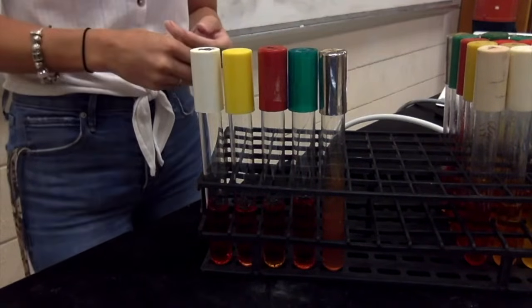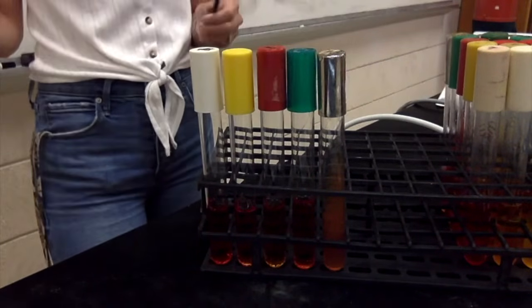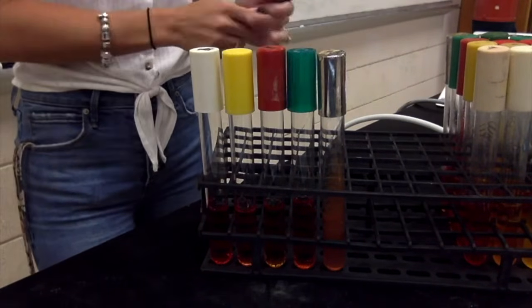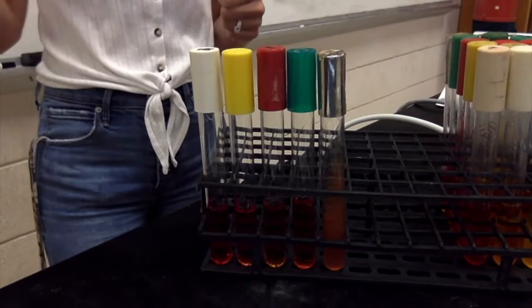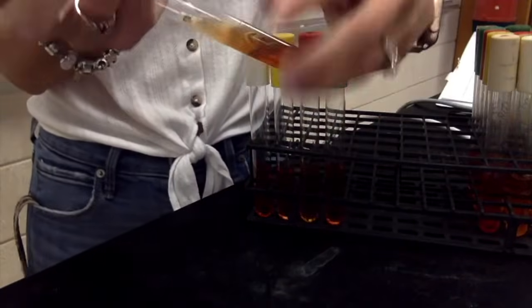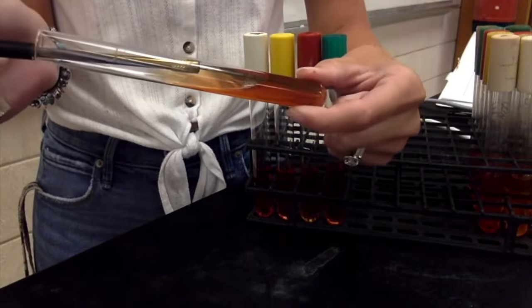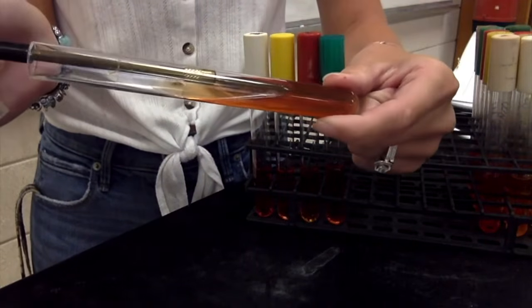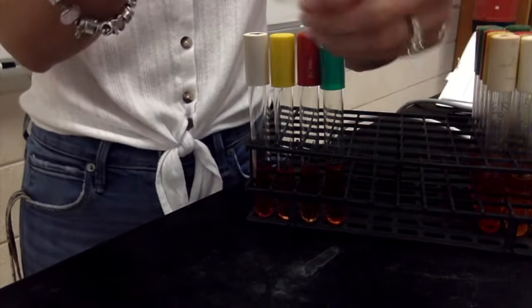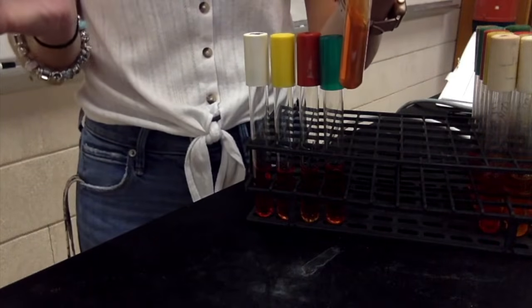Okay. So to inoculate these tubes, now I'm not actually going to inoculate them, but I'm just going to show you how I would do it if I was doing it in class. I would use my loop, flame my loop, go in and get my bacteria. You could use it off of a slant. And to inoculate the TSI, I would stab all the way down to the bottom of the tube, and come back up and slide across the top of the slant.